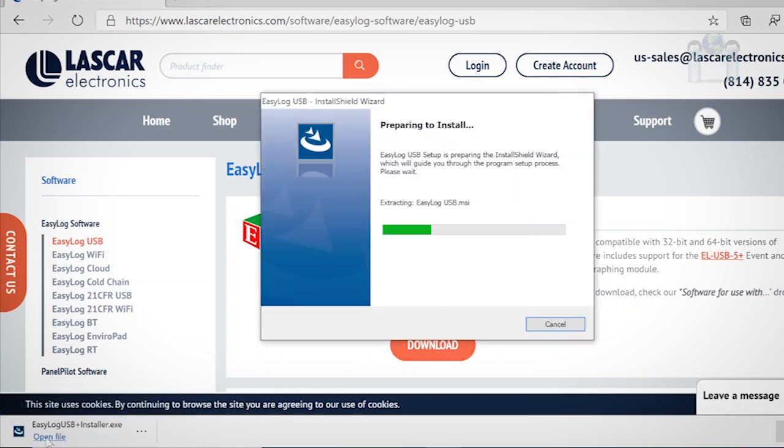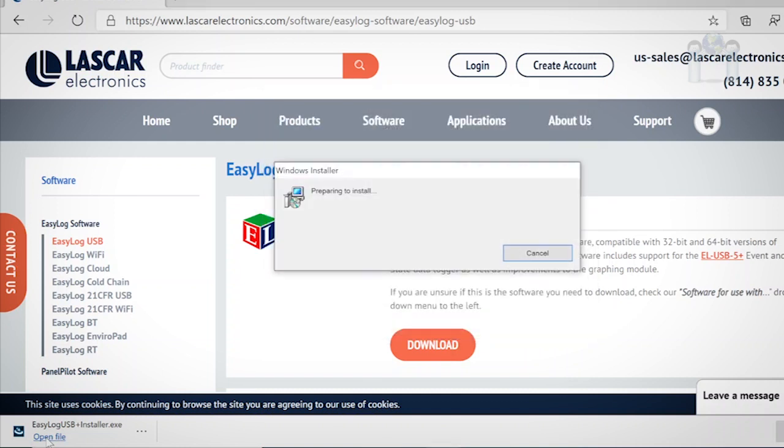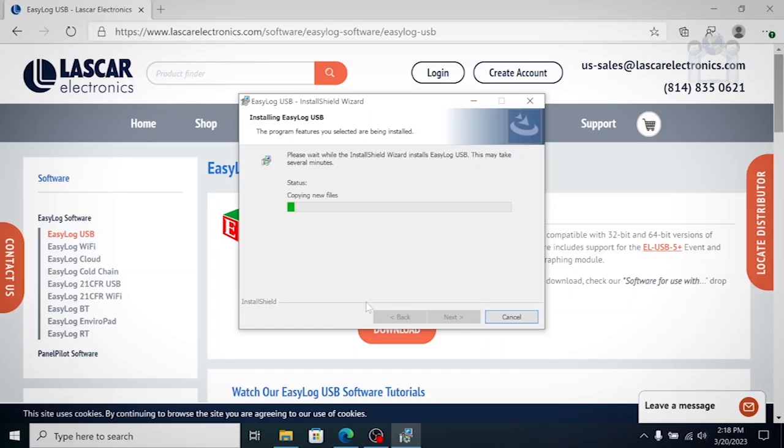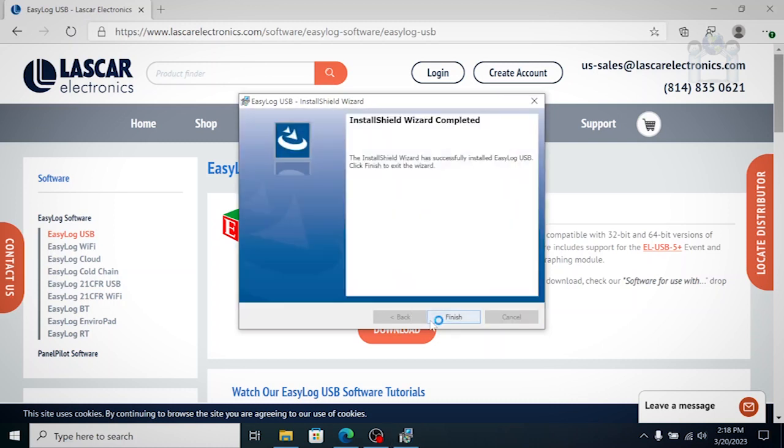The installation is very basic. Just acknowledge the agreement and follow the prompts. When finished, click the Finish button.